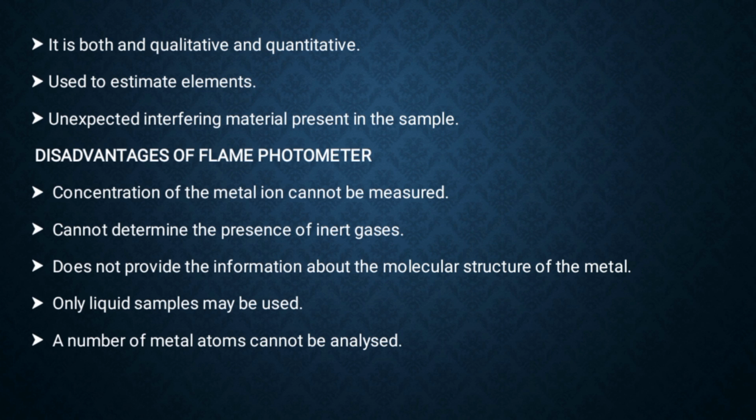The accurate concentration of the metal ion in the solution cannot be measured, and the presence of inert gases cannot be directly determined. This technique measures the total metal content present in the sample, and does not provide information about the molecular form of the metals present in the sample. Only liquid samples may be used. The sample preparation becomes lengthy in some cases.